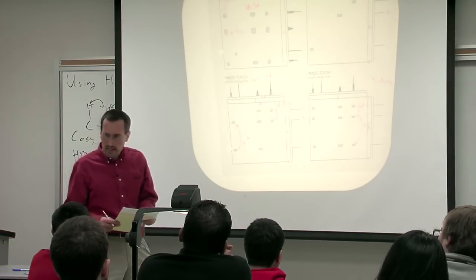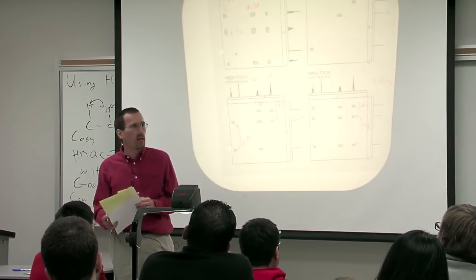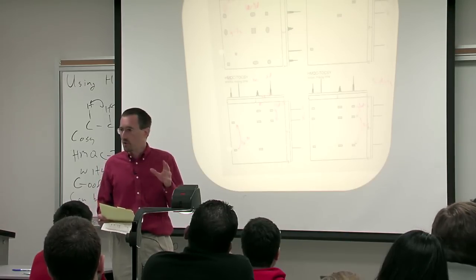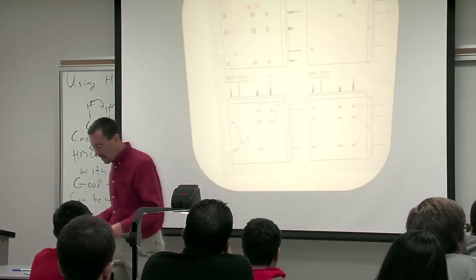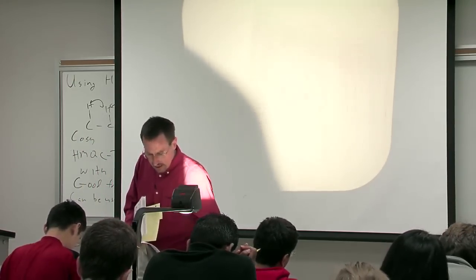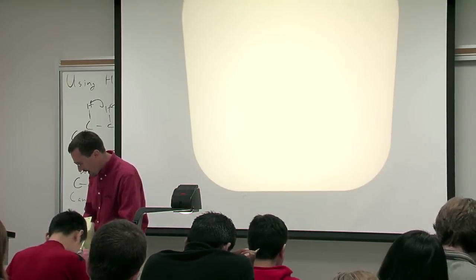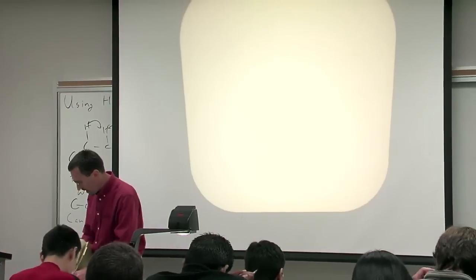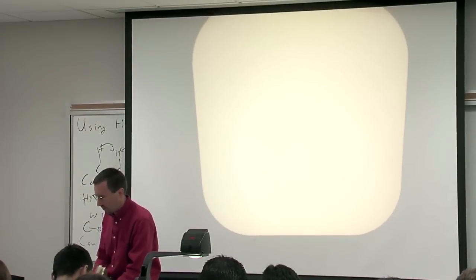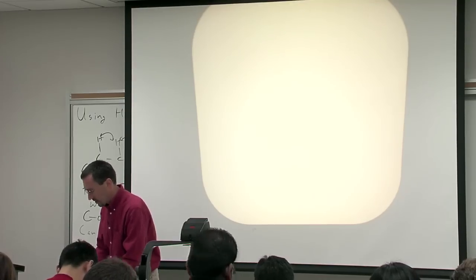And the best way to see this now is really to go ahead and look at this applied to our current problem of the bromomaleol isomer. So what I'd like to do at this point is go to the next page and show you first a schematic, but then we'll go to the real spectrum, and then we'll use the real power of varying the mixing time to really build up this structure.